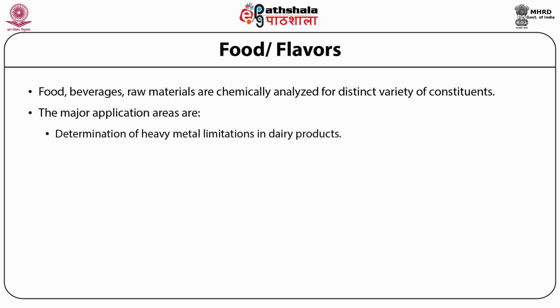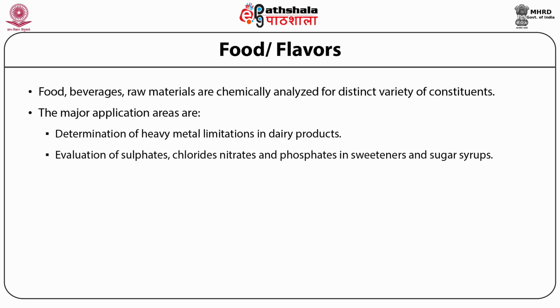determination of heavy metal limitations in dairy products. Evaluation of sulfates, chlorides, nitrates, and phosphates in sweeteners and sugar syrups.